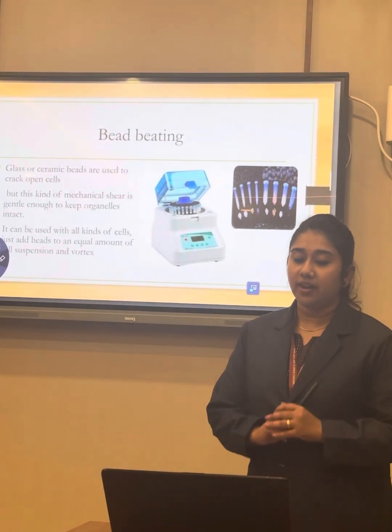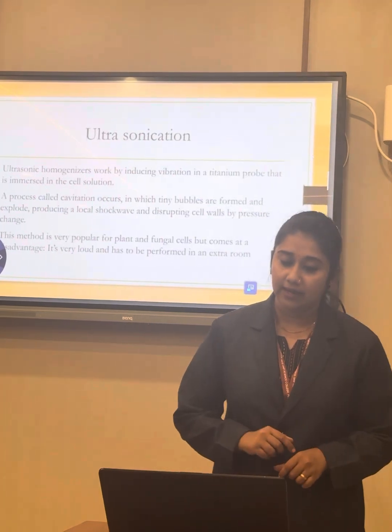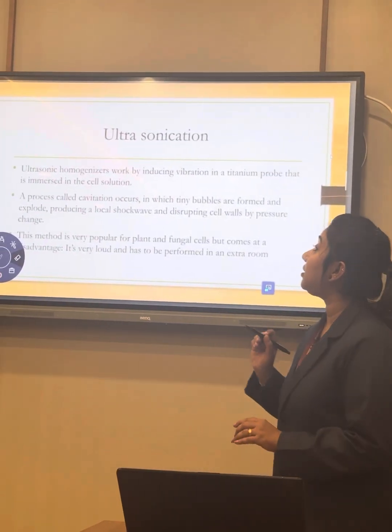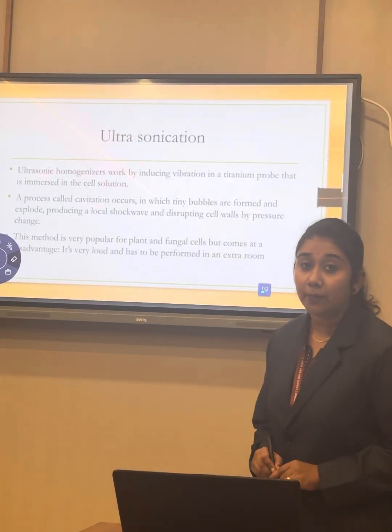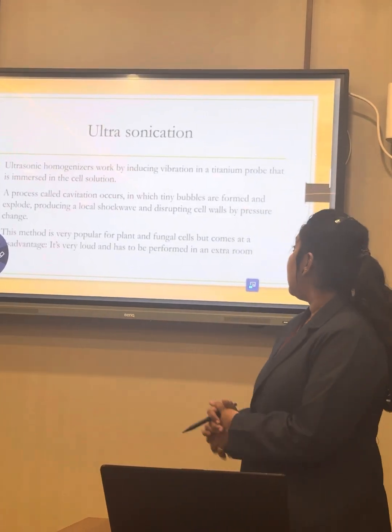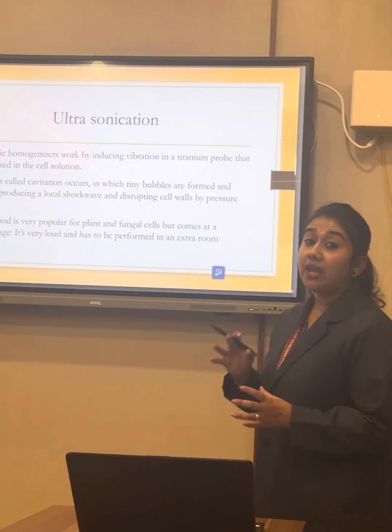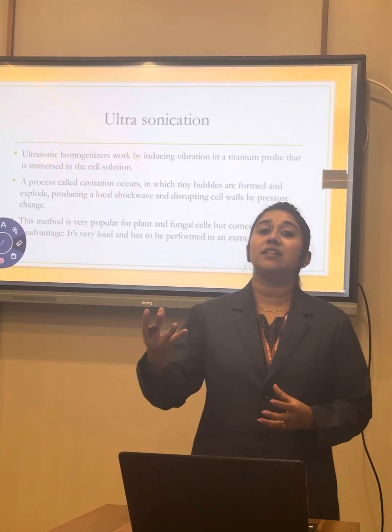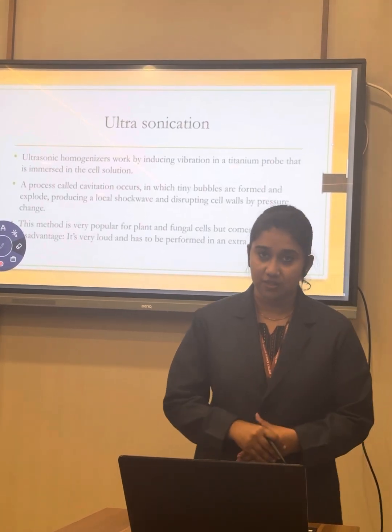Okay? Next mechanical method is ultrasonication. Ultrasonication is also a mechanical method for obtaining intracellular proteins. It works by vibration. We use a titanium probe which is immersed in the cell suspension.